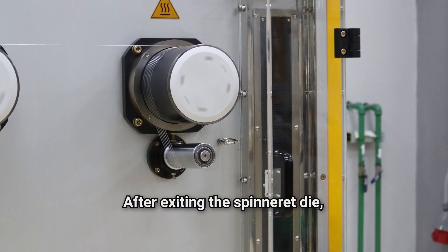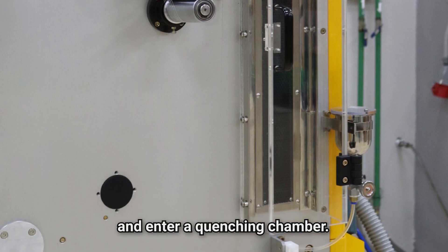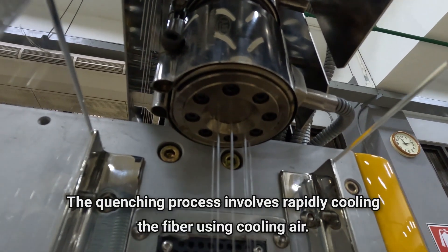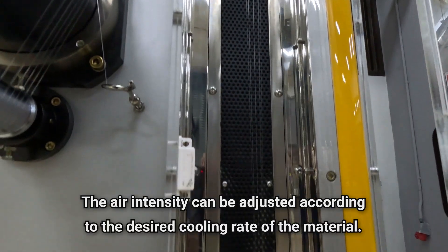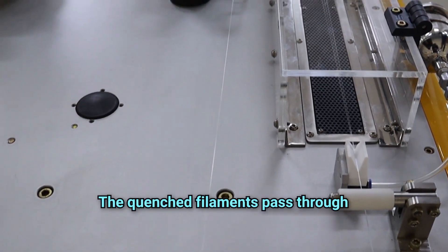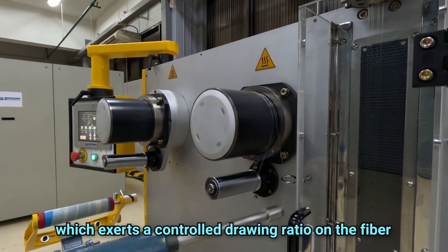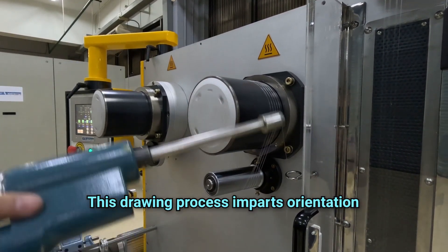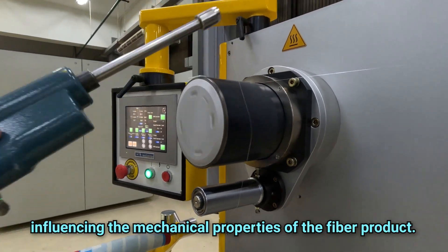After exiting the spinneret die, the molten polymers are shaped into continuous fibers and enter a quenching chamber. The quenching process involves rapidly cooling the fiber using cooling air. The air intensity can be adjusted according to the desired cooling rate of the materials. The quenched filaments pass through a series of free rolls towards the godets, which exert a controlled drawing ratio on the fiber. This drawing process imparts orientation and alignment to the polymer chains, influencing the mechanical properties of the fiber product.